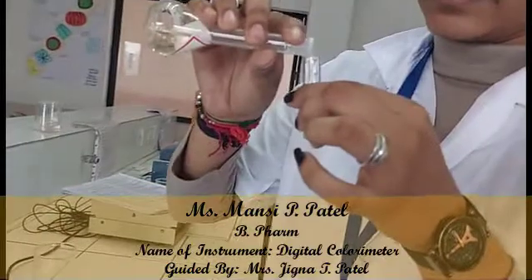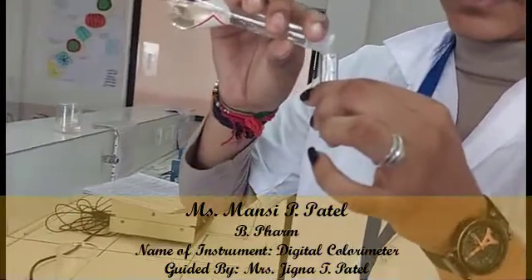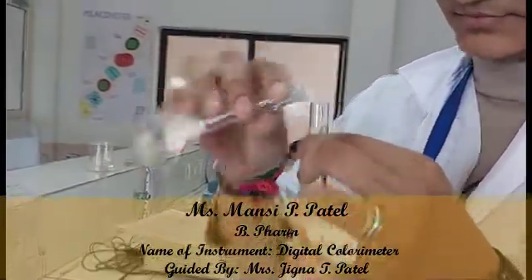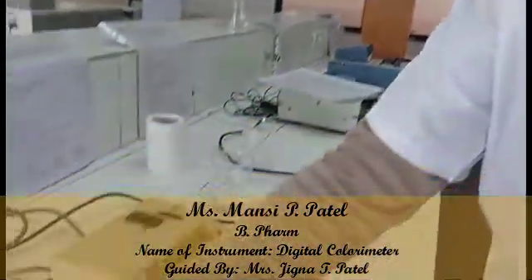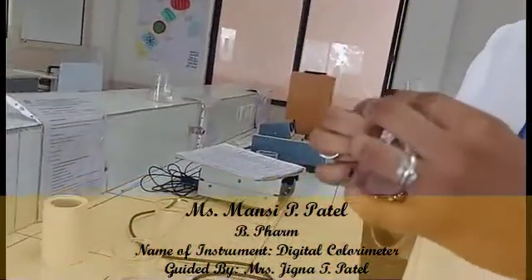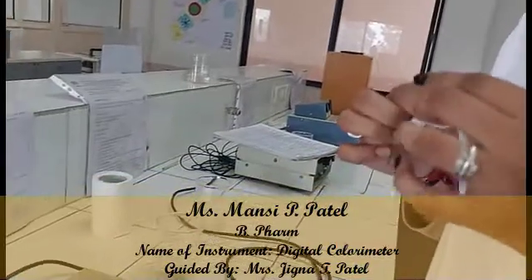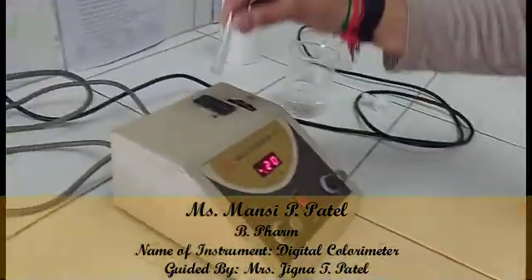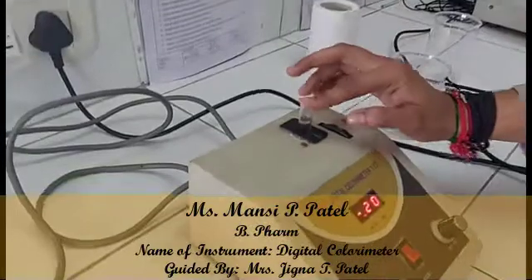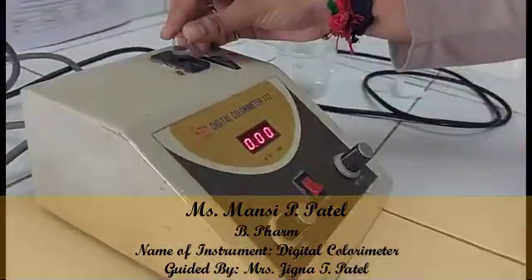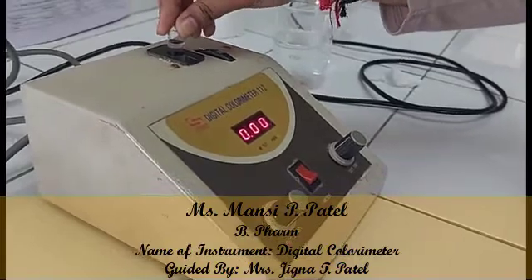Now pour the blank solution in the cuvette, put it into the holder, then set 0 and note down the reading.